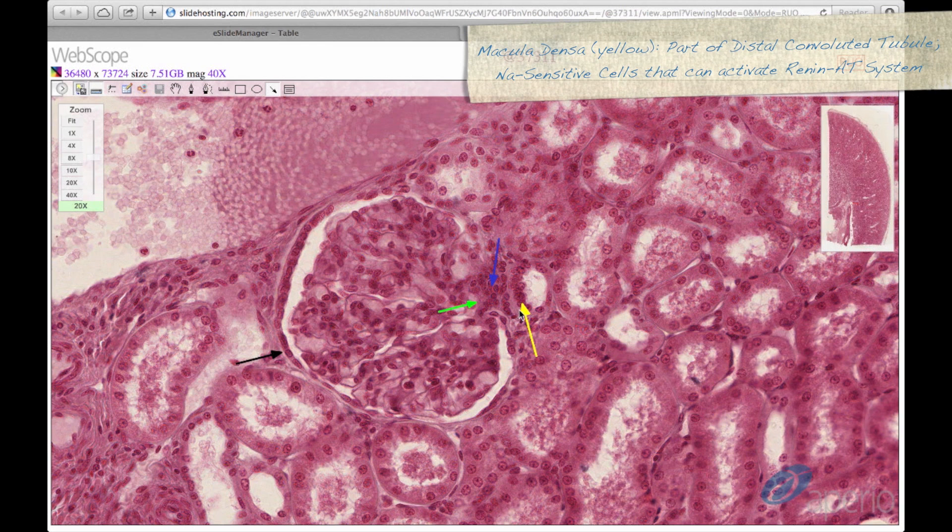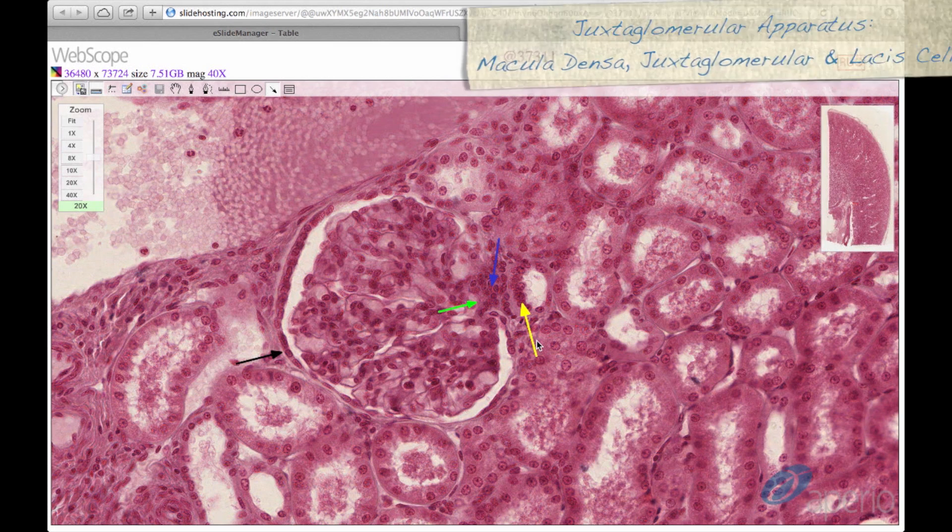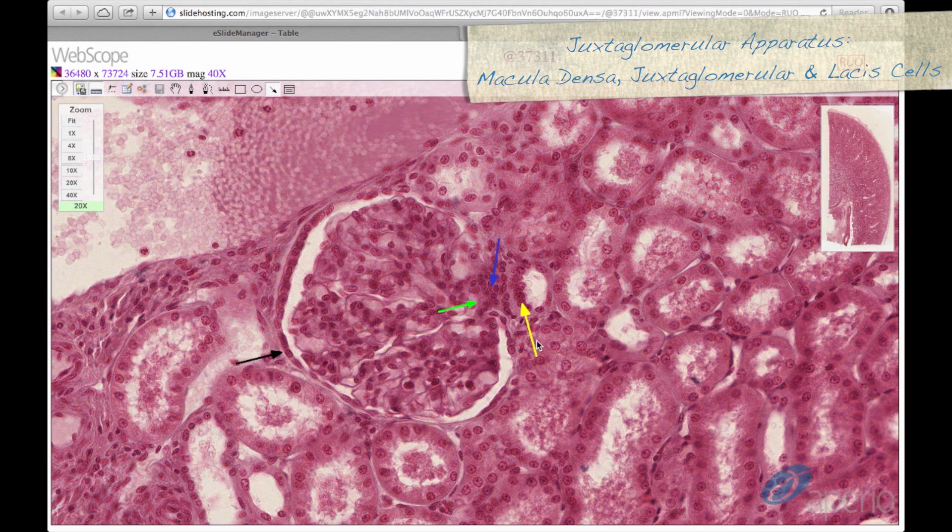Macula densa cells are seen here at the yellow arrow. They are a thickened portion of the distal convoluted tubule. This acts as a sodium concentration sensor, which can activate the renin-angiotensin system if needed. Macula densa cells, juxtaglomerular cells, and lacis cells, which we will discuss later, make up the juxtaglomerular apparatus.